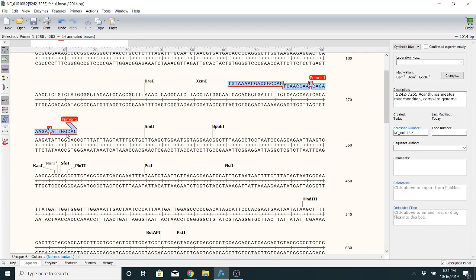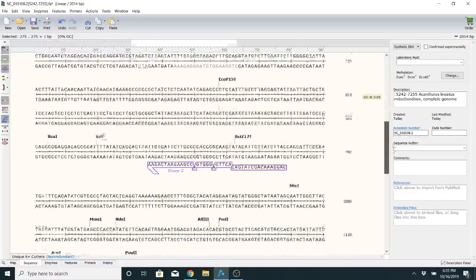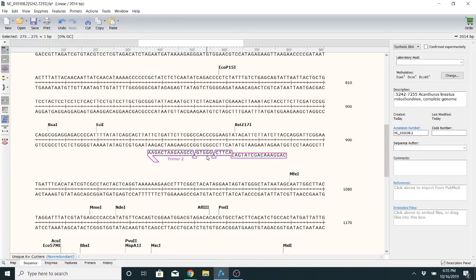So if you know the species and you know that this is a perfect match, then you can sort of theoretically calculate the binding temperature. But if there are variations, then, for example, these two aren't bound, so that's going to affect the amount of energy that is required to get this primer to come loose. So it's going to be less efficient at binding. And this over here. So if you were a species that had 4 or 5 places where it wasn't binding, or down here, if you had 4 or 5 places where it wasn't binding, then you could have a different annealing temperature.